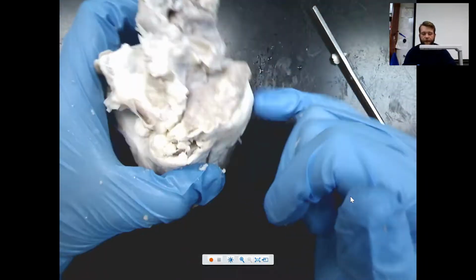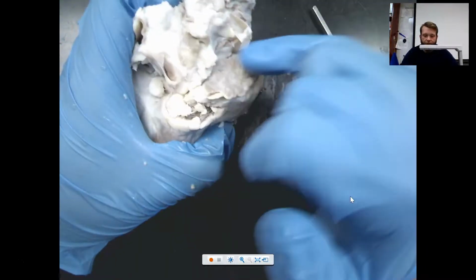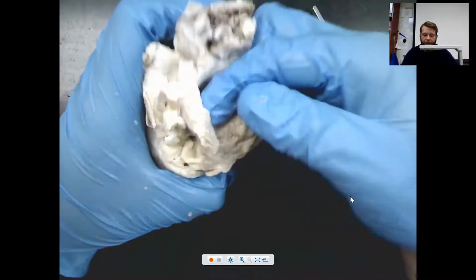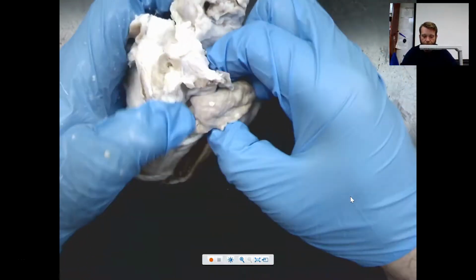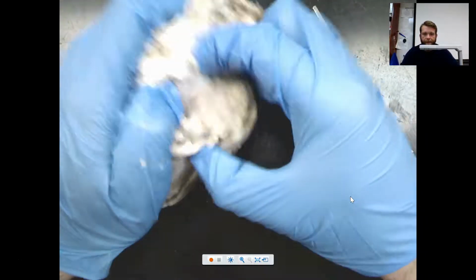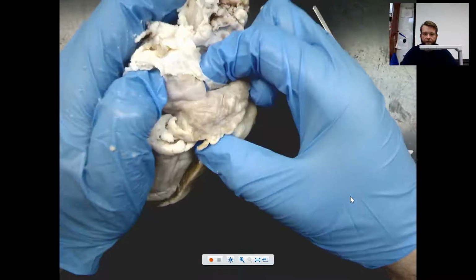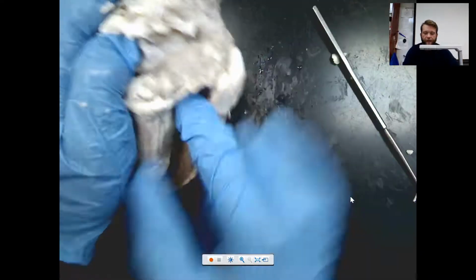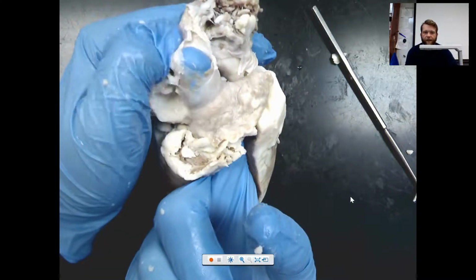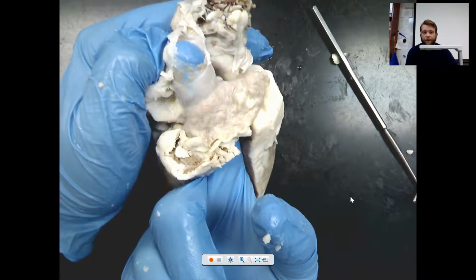If you look on this side with our right atria, we're going to see this vessel that's right here. This vessel that's going directly into our auricle. So this flap right here. So this wide vessel here that's actually collecting blood, and if I put my finger through here, you can see it from the inside of the heart.